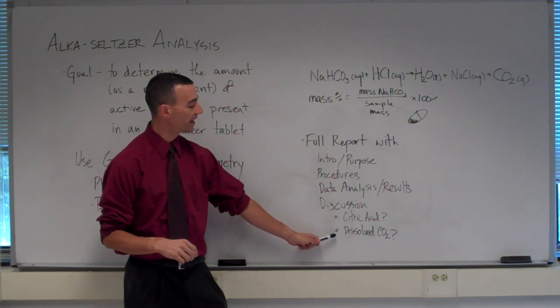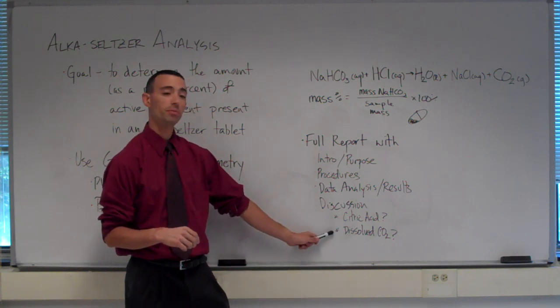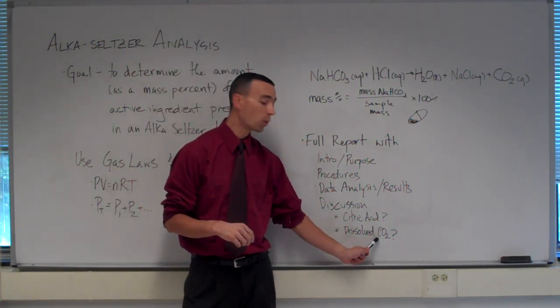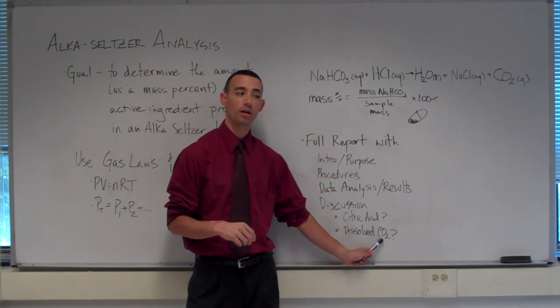Why do we dissolve an Alka Seltzer tablet in our setup before we begin? This relates to the issue of intermolecular forces, which we've been addressing in lecture in chapter 11. Carbon dioxide, while it is a nonpolar substance, does dissolve to some extent in water.